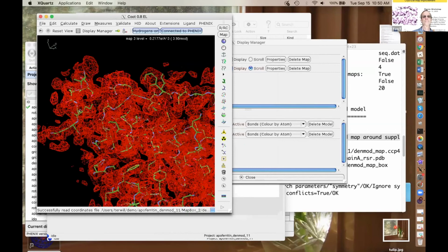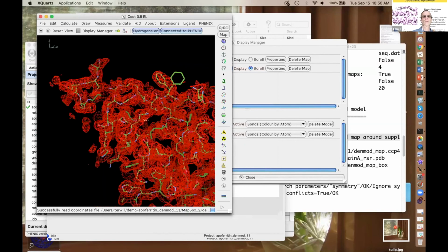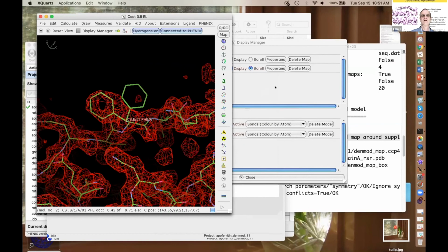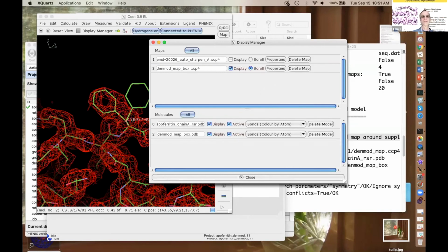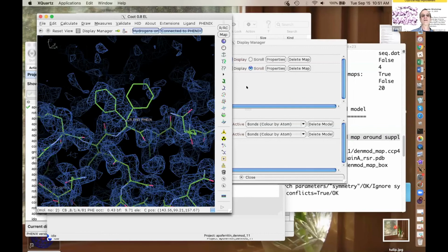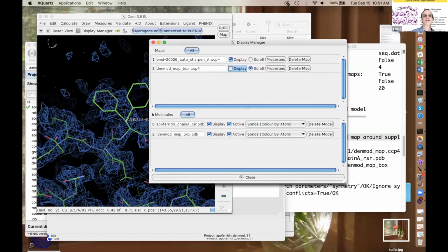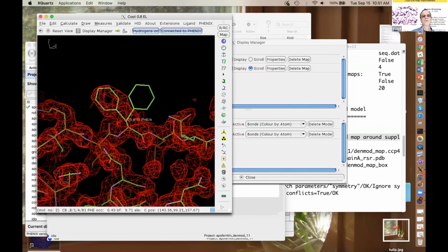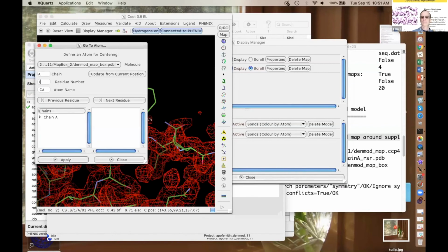Okay. And so let's come back to the same place we were looking before, and we can compare the maps that we've got. All right. So you can see I just adjusted that to optimally look at that phenylalanine. So our original map was not that great in this region, and it was noisy generally. I told you it's a little over sharpened, and you can get a map that looks a little bit better, but there's no way that I can figure out that you can take that starting map and auto sharpen it and make it look nearly as nice as our density modified version. So it's really cleaned up both by reducing the solvent noise, which of course it does because it's flattening it, but also improves the details of our molecule. And so this residue is pretty good. Another one that is improved quite a bit is residue 13 here, another side chain.